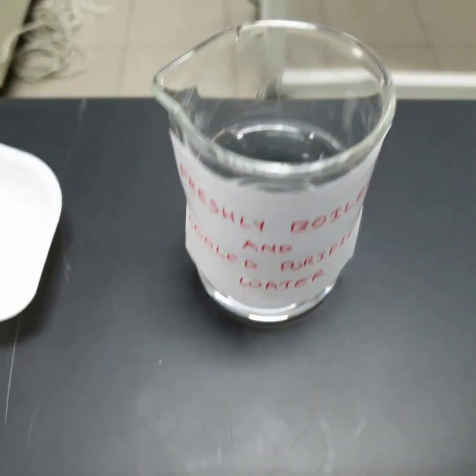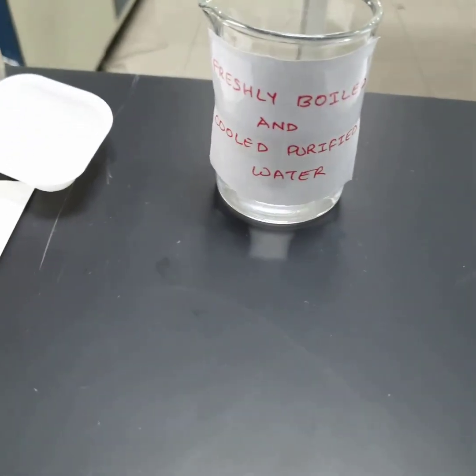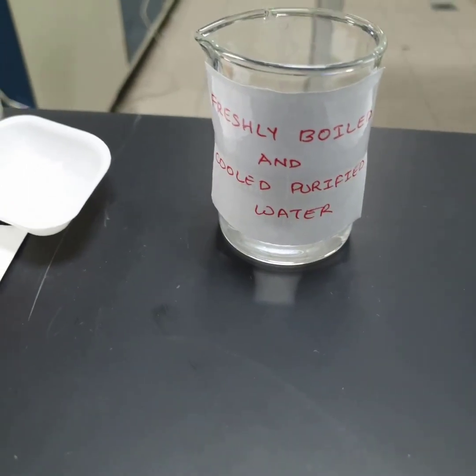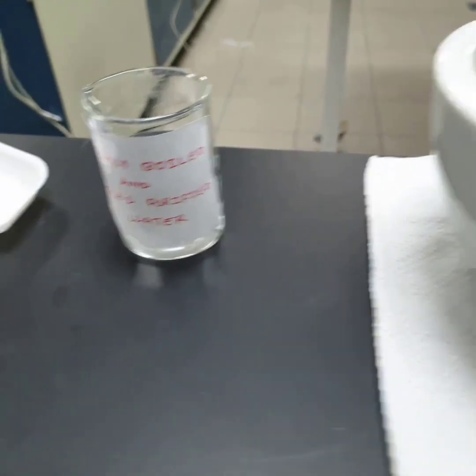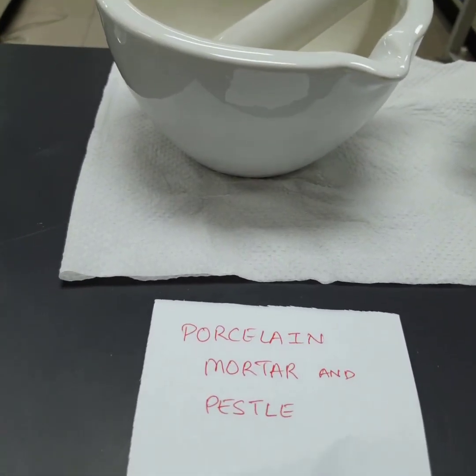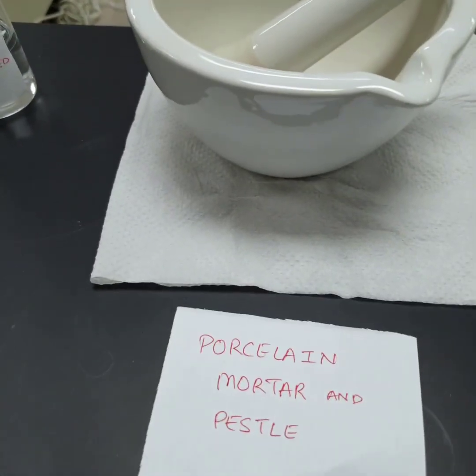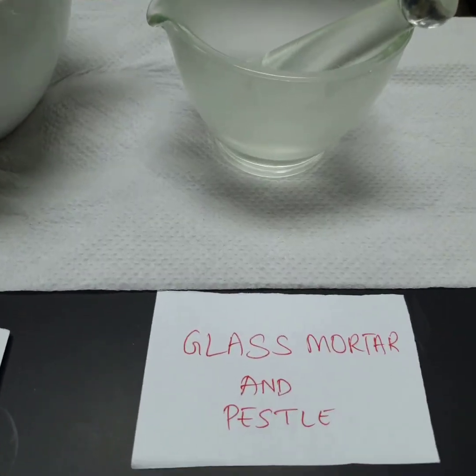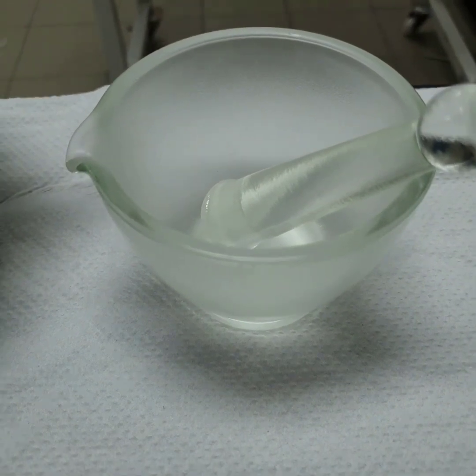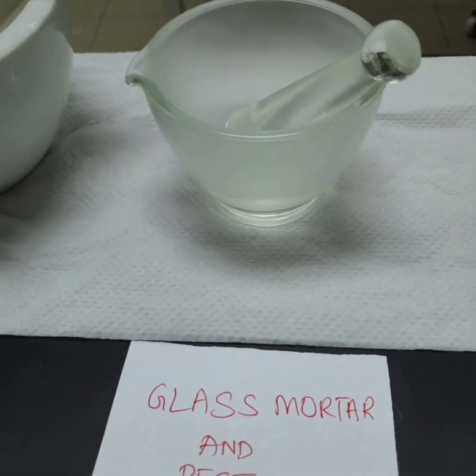So I have in the beaker added this freshly boiled and cooled purified water in unknown volume because we don't know the exact volume we are going to need, but it will surely be below 50 ml. And the tools which we are going to need are porcelain mortar and pestle. We are going to add suspending agent in this porcelain mortar and pestle, and first we are going to use glass mortar and pestle. This is glass mortar and pestle. We are going to crush the tablet with this glass mortar and pestle.